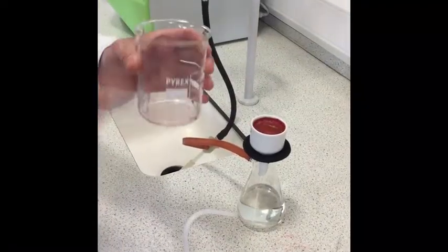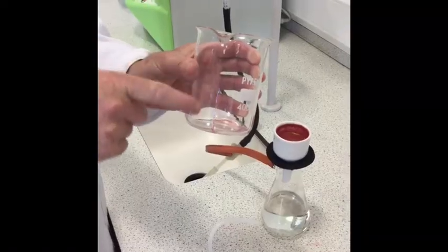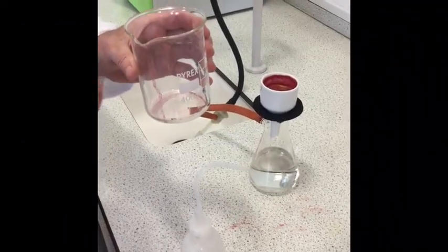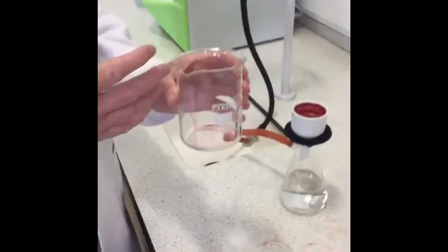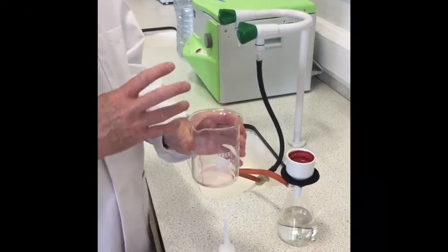The chances are you will leave a little bit behind. You can see some markings down the outside of the flask where some of the precipitate has been lost. So this to some extent will account for the fact that you will not get perfect results, because in gravimetric analysis you very often get these transfer losses. Some of the precipitate is left behind.